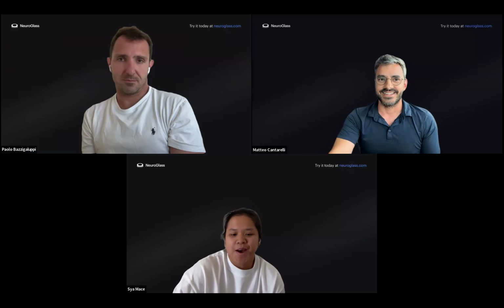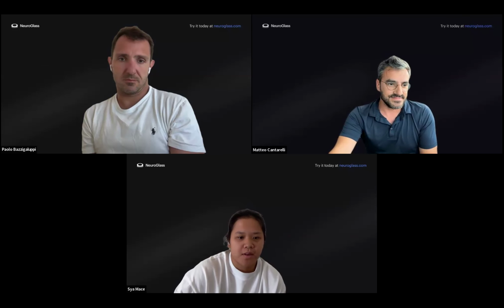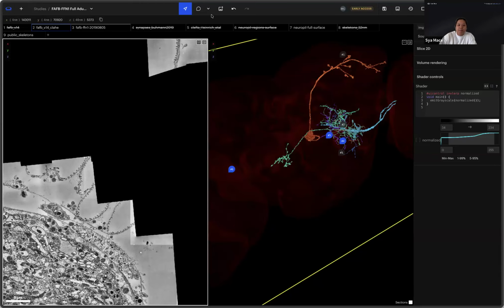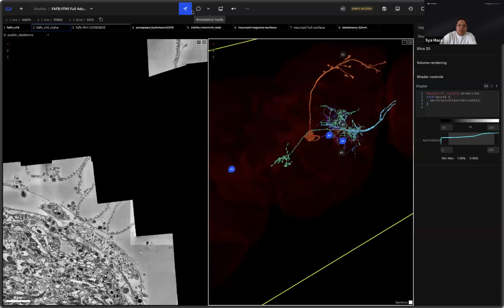Cool. Thanks, sir. Right, let me just share my screen. Cool. So as Matteo has mentioned, two things I'll go through today: comments and tasks. First thing being comments. These are things we're actively working on. It's not live yet, but it will be soon.